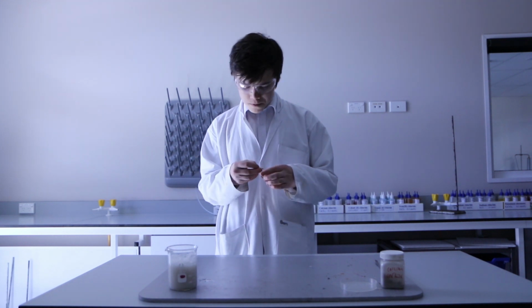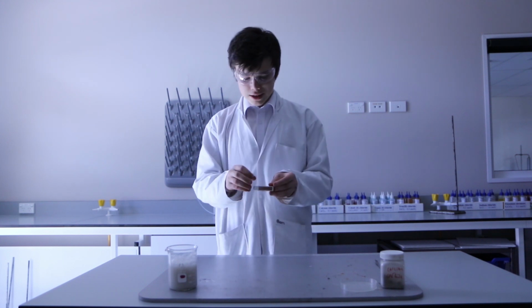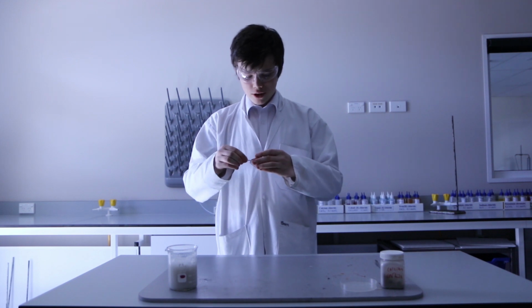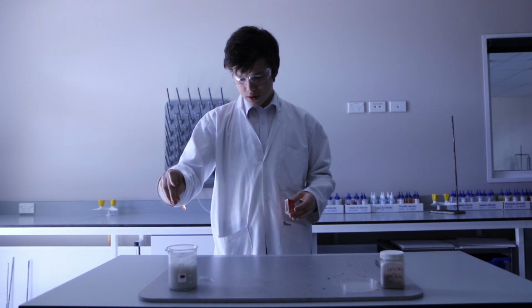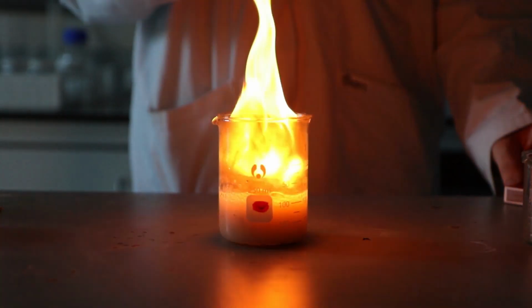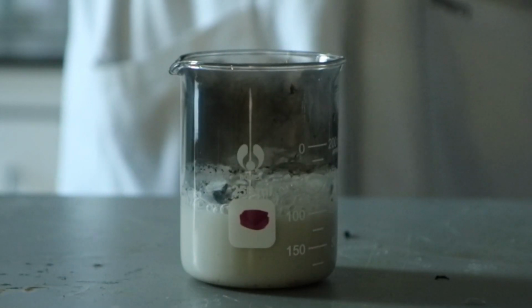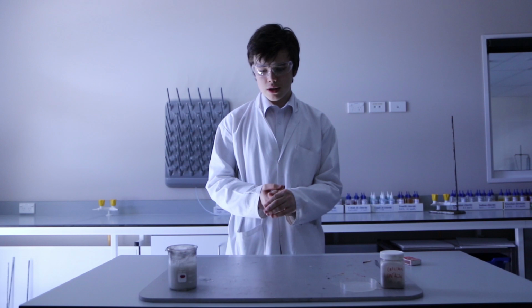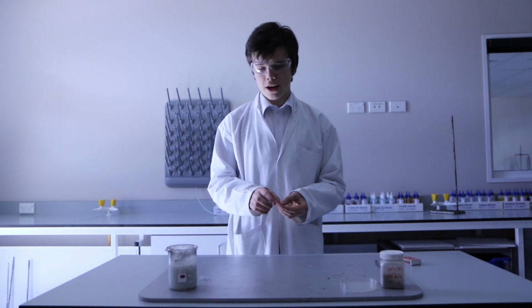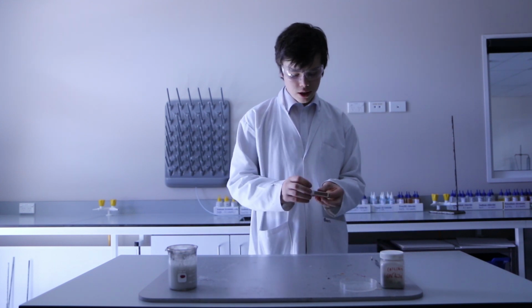Acetylene gas is flammable. Here's a flame. It went out. Acetylene gas is flammable. But matches aren't very good. There we go. So you can see when that went off, there's all the soot around the edge of this beaker, and that is carbon left over from the incomplete combustion reaction that is taking place when I take a match to the gas.